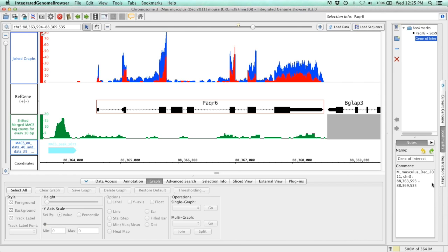And call peaks using MACS. And then, as we demonstrated here, you can create some really good graphics comparing your data, and it allows you to really easily jump between chromosomes in the genome and look through your different peaks and see what genes they are close to. So it's just a really great tool to do this. And with that, I'll take any questions or comments.